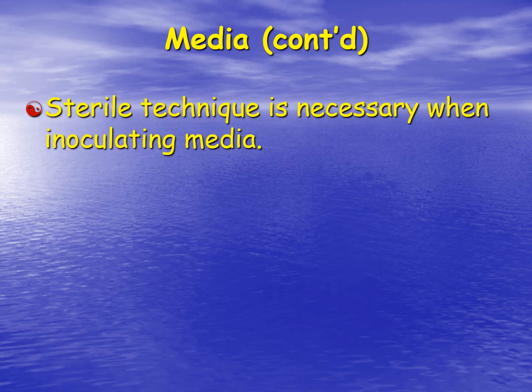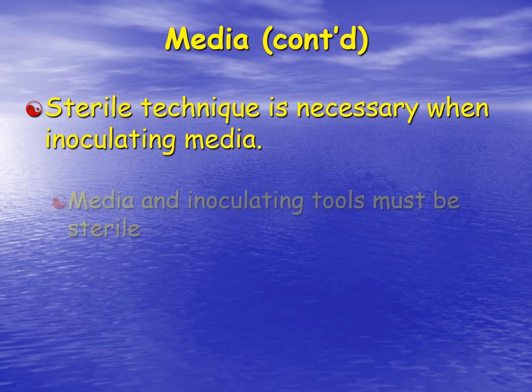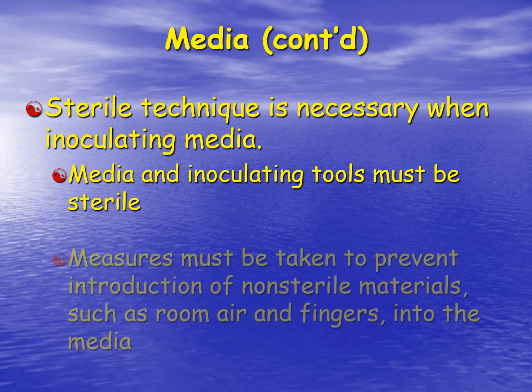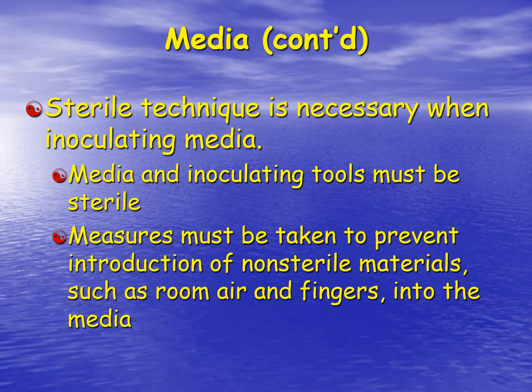Sterile technique is absolutely necessary when inoculating media. You do not want to introduce other organisms into the media. The media and the inoculating tools must both be sterilized. Measures must be taken to prevent the introduction of non-sterile materials such as room air or fingers or other things into the media. And hopefully we will be in class long enough for me to demonstrate some of these, but you will also learn these in the laboratory.